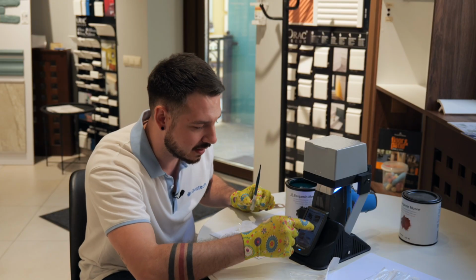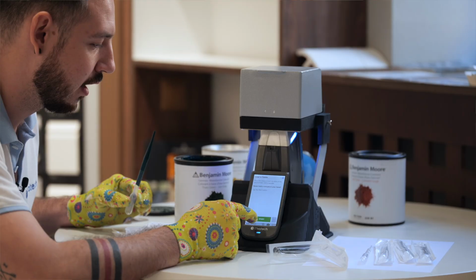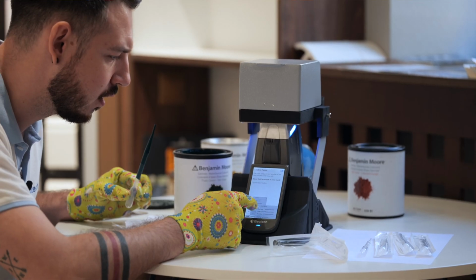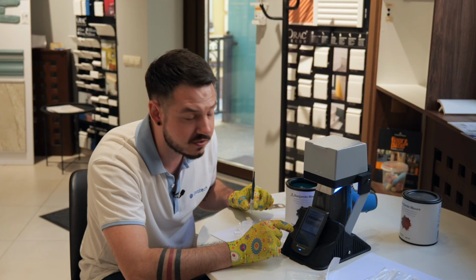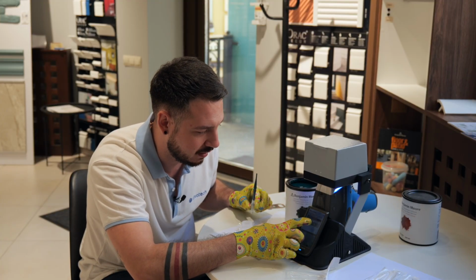So we're selecting the calibration lead-in paint. Also, we can just set a measurement time. Let's say 5 seconds of duration is okay, absolutely all right, just for fast screening.